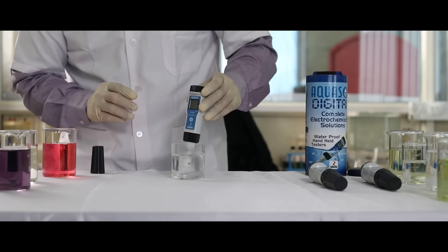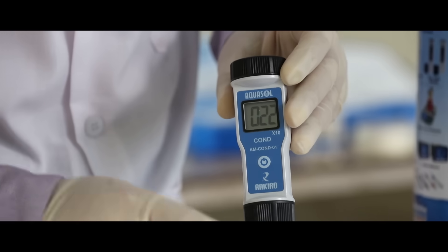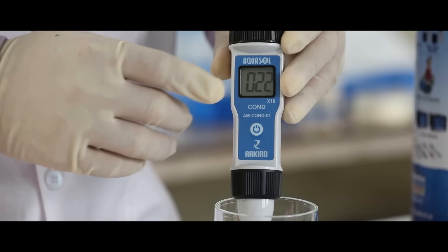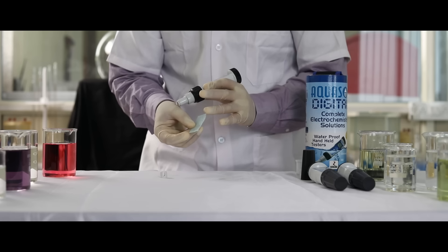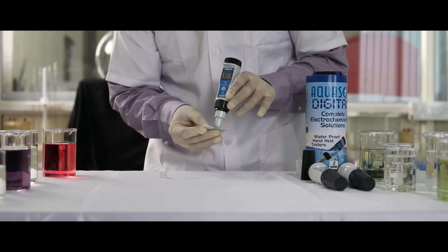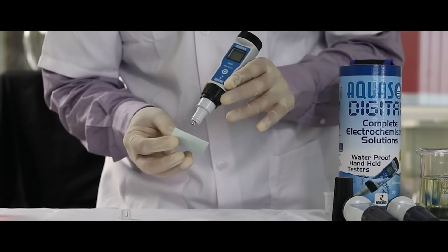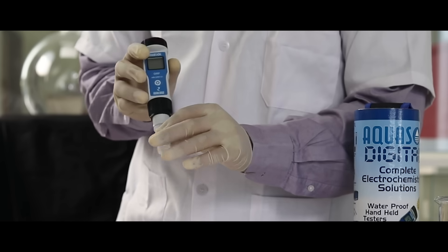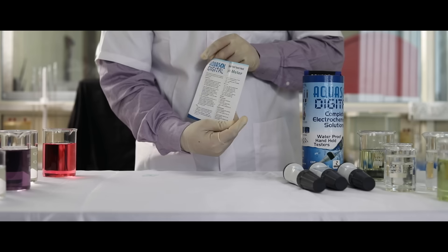Dip the electrode in the sample. Stir gently for a stable reading and note the reading. If the electrode tends to perform slowly, use the sandpaper provided to polish the electrode. Use the rough side of the paper and gently polish, holding perpendicular to each other. Once done, screw the electrode cap back. For better understanding of this product, please refer to the instruction leaflet provided.